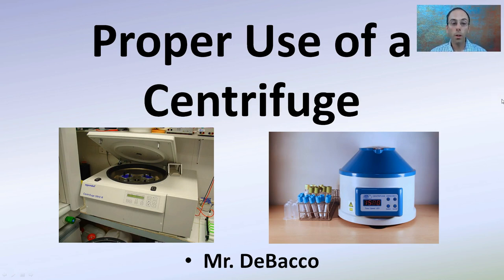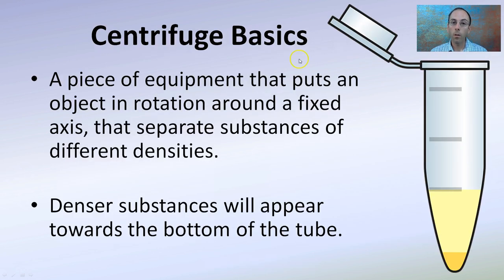Here I'm going to go over the proper use of a centrifuge. While they may look different, they all operate in the same basic way. The basics: a centrifuge is a piece of equipment that puts an object in rotation around a fixed axis. It spins, and the whole point is to separate substances of different densities.